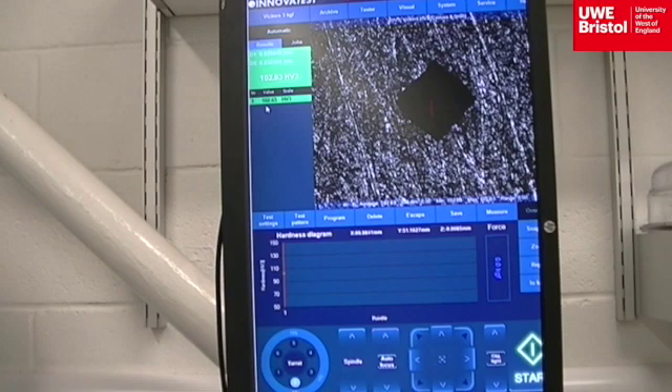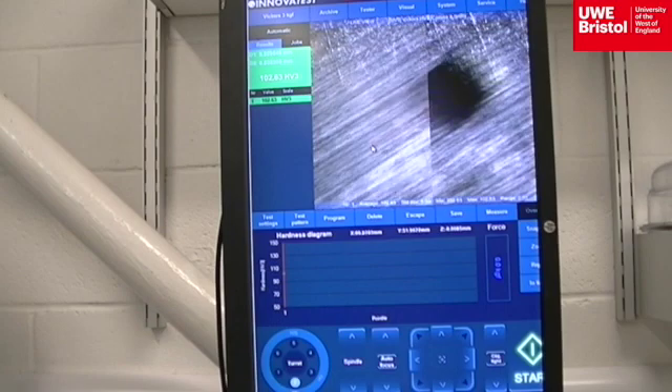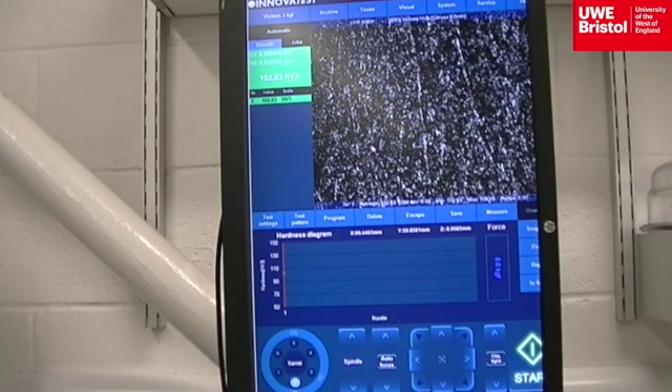If a clear image is not achieved that allows for measurements to take place, instead of moving the specimen by hand to another location for a new indentation mark and potentially catching the indenter's point, clicking and dragging the mouse over the screen image moves the platen with the same movements in the X and Y directions. The green indicator light is observed to ensure the indenter is not hovering over the edge of the specimen.